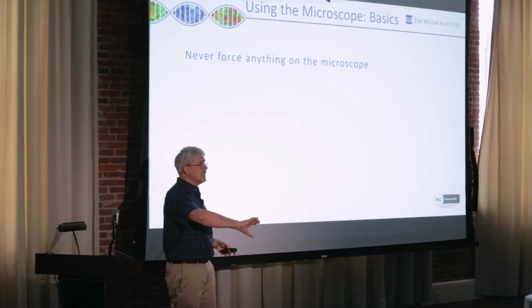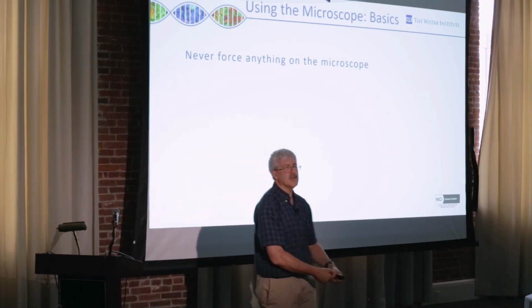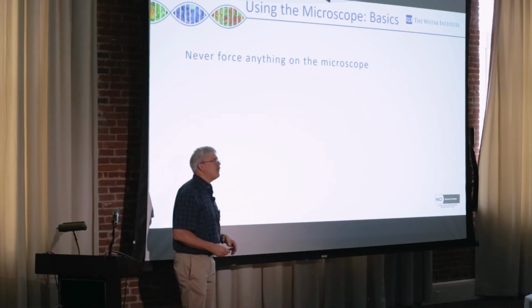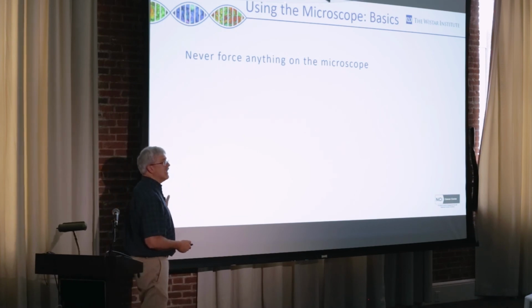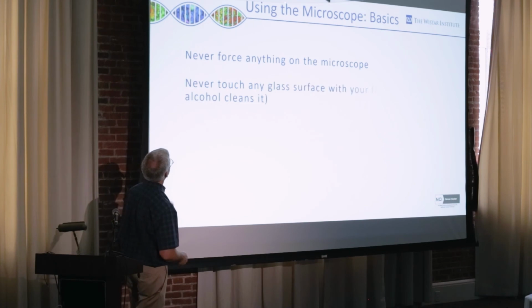All right, so basics of using any microscope, never force anything. All right, if you're trying to focus and it's not going, do not go another chunk. That's when you hear that famous crack, awful sounds. You don't want to hear those noises. So never force anything. Something's probably in the way. Figure out what it is or get some help.